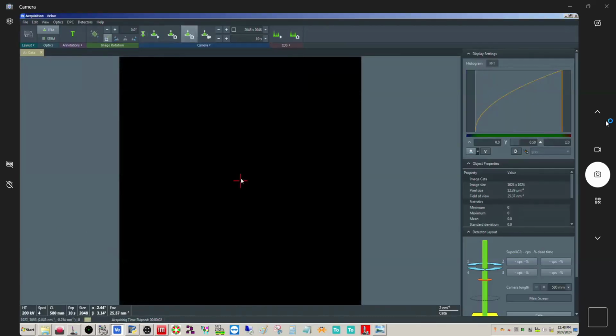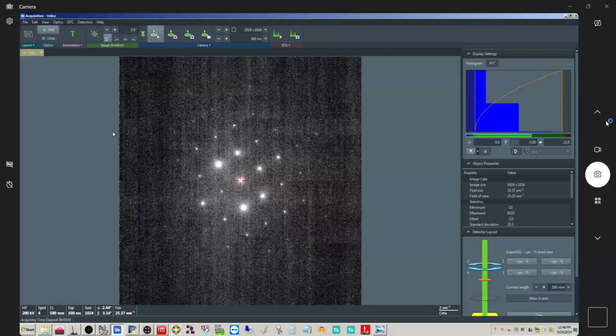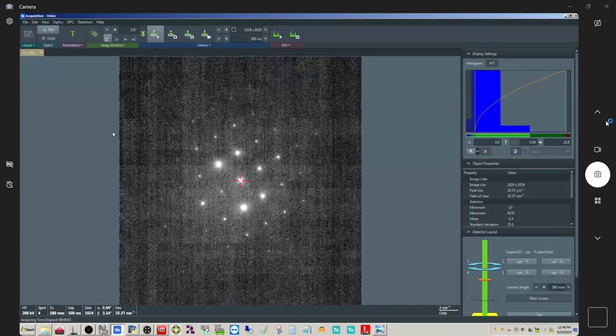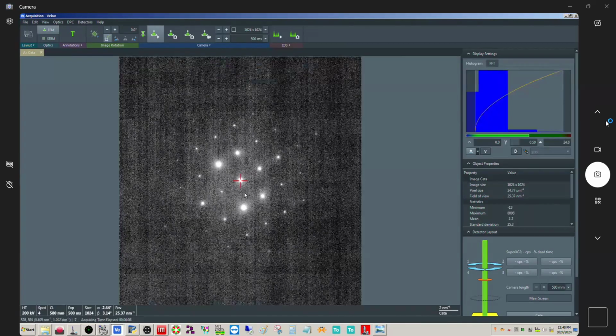Now, this is a CMOS camera. With a CMOS camera, changing the binning doesn't do much in terms of the counts, because that's done off the chip. With the CCD, this is more pronounced. And actually with a CCD, using higher pixel resolution is very helpful when you do this, because you're spreading that signal out over more area.